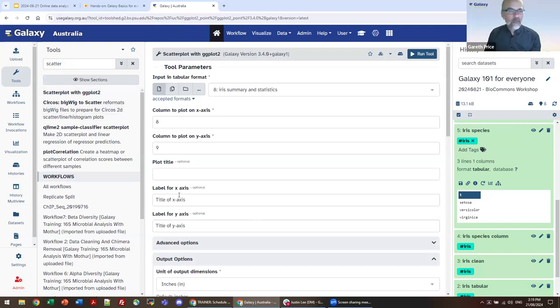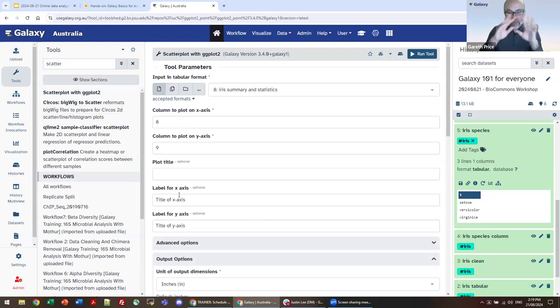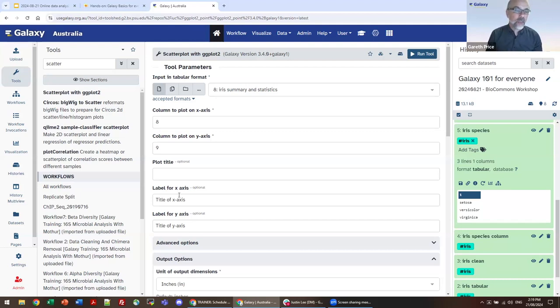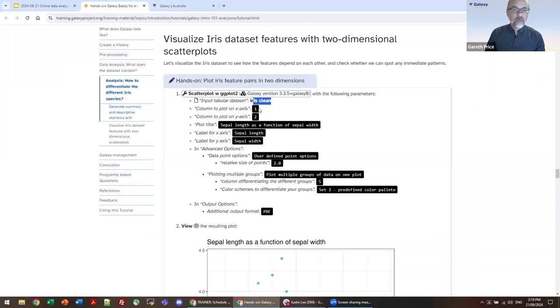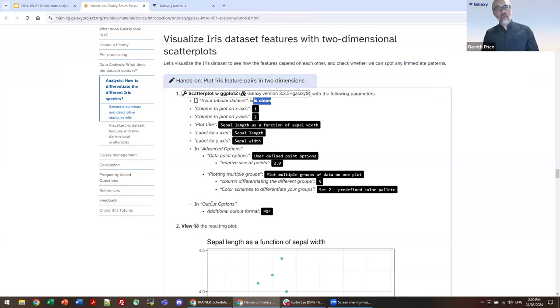This is one of many visualization options in Galaxy. Circos plots are a fantastic way of visualizing chromosome data with variant data and species data on top, and can be built iteratively in Galaxy. In this particular case, we're going to set up a scatterplot — again the inertia is in the setup but the opportunity is in the repeatability.